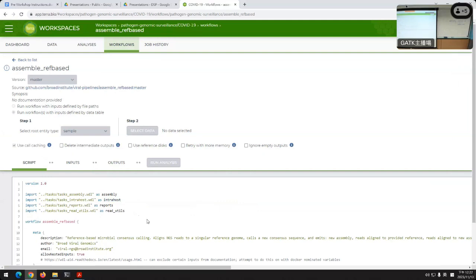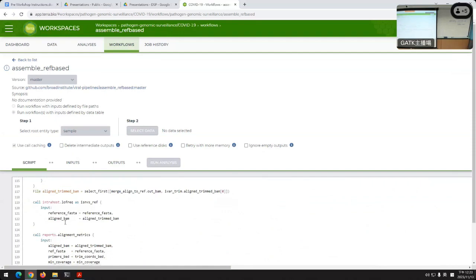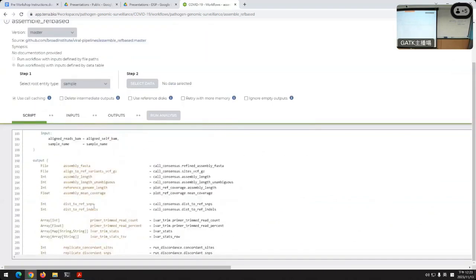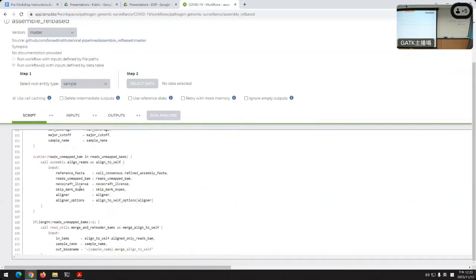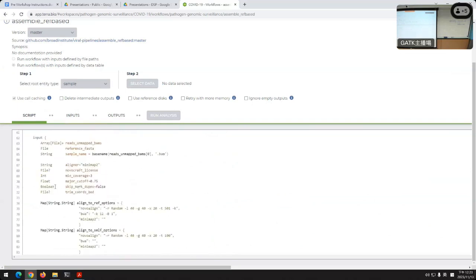If anybody is curious about how to do that, I can absolutely demonstrate that as well. The reason that the script is exposed here is just so you can take a look at what the workflow is actually doing. Obviously you can see what packages it uses, but more importantly, you can look for the different command blocks and see what the outputs are, what the commands are actually doing. You can find what the cloud environment is.